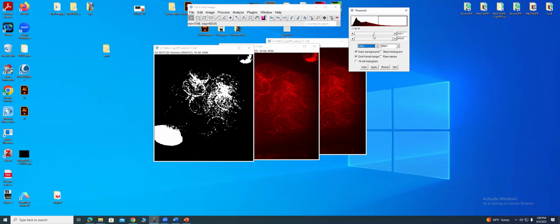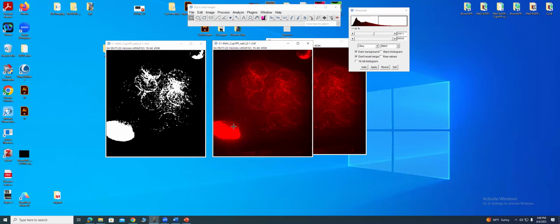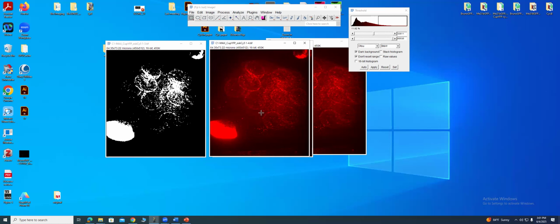So this is when it comes to you trying to do histogram stretching and histogram equalization. If you look at this image, let me just make a duplicate again. Which technique do you think we should use to equalize our histogram?